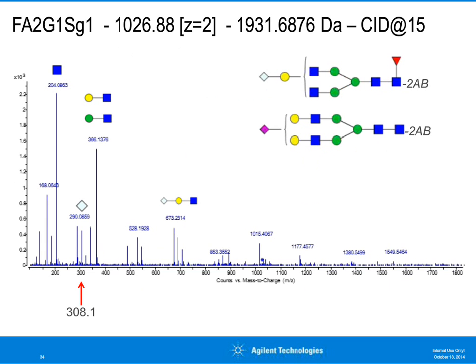The presence of those 2 strong signals and the missing of 292 or 657 that would have indicated the presence of NeuAc confirms the glycan containing NeuGc as sialic acid.